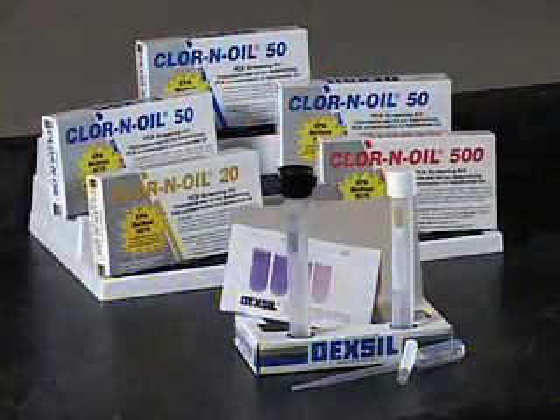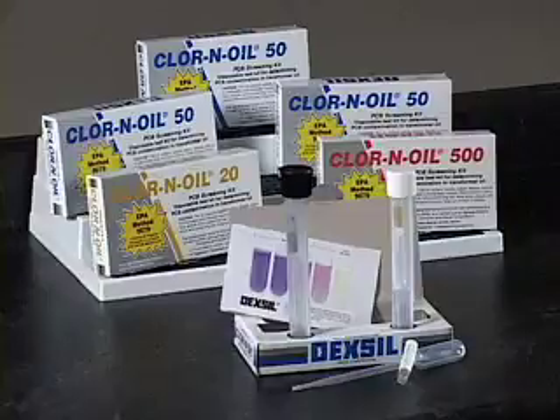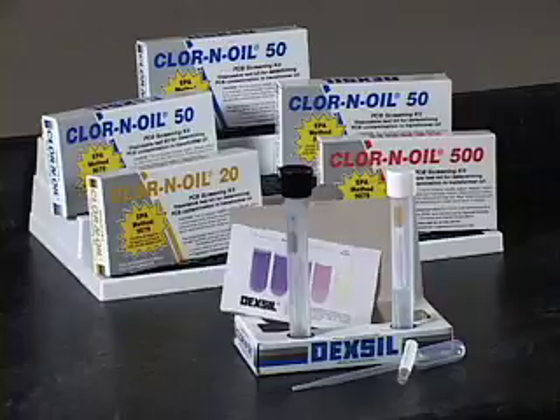Clor-N-Oil screening kits are a fast, easy-to-use method for determining PCB contamination of dielectric oils. The kits provide colorimetric go/no-go test results at three action levels: 20, 50, and 500 parts per million.